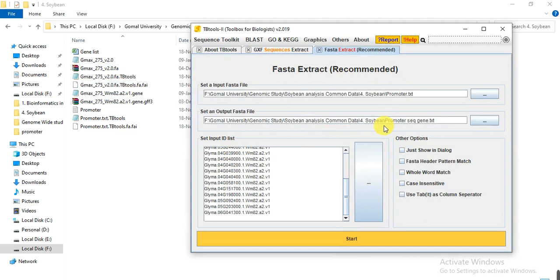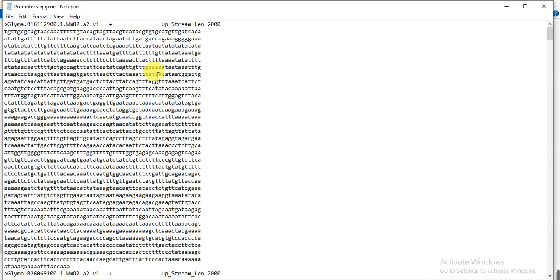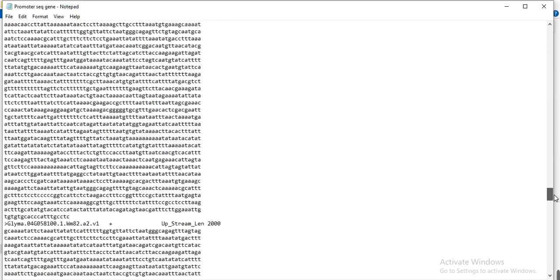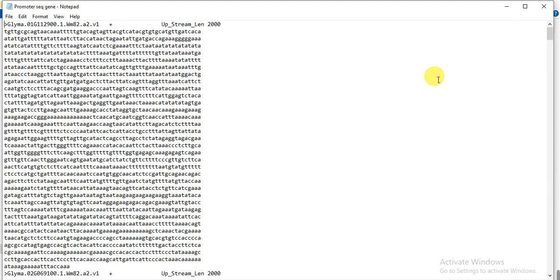I had forgotten a slash in the path, so I added it and ran it again — 'Extraction finished, all records found and extracted.' Now I have the promoter region file for my specific genes. First we made the promoter region file of the whole genome, and from that file we extracted the promoter region of our specific genes in a single click. By following these steps you can get the promoter region of thousands of genes in a single click. Hopefully this video helps — please like, comment, and share. Thank you!